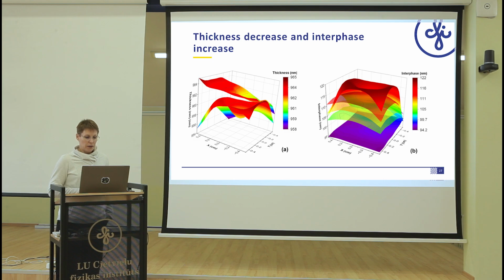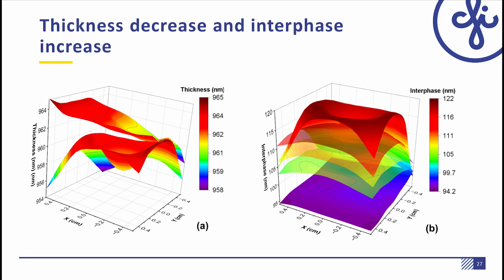By applying models, we obtain these results. These maps show two key effects induced by UV radiation. Each surface map, which you see here, is a different time point during exposure. On the left, we see how the light is introducing changes in the film thickness. We see a small thickness reduction under UV light, which is attributed to the lattice contraction. On the right, these are clear.